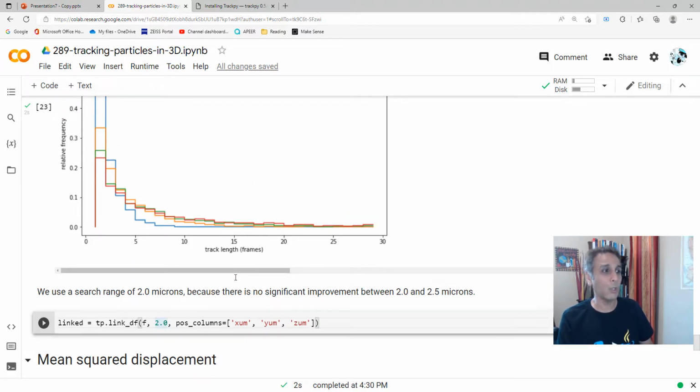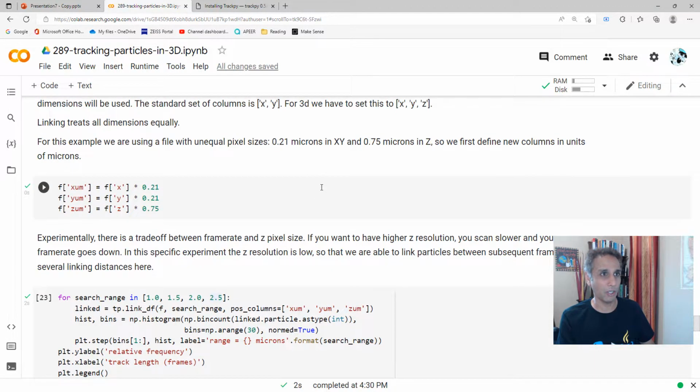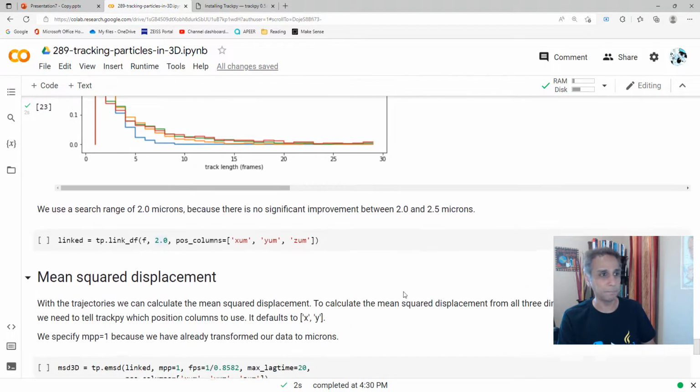You could have directly jumped into, okay, I know that the size of my particles is about 1 micron in Z, and here 0.2. Maybe I'll just do 3 times that, just to pick the neighborhood distance, or in this case, it would be 6 times that. Yeah, so almost 6 times that. So that's what we are trying to do here.